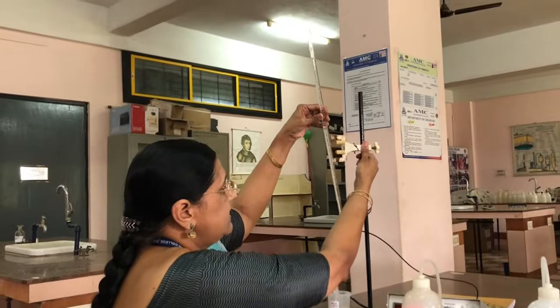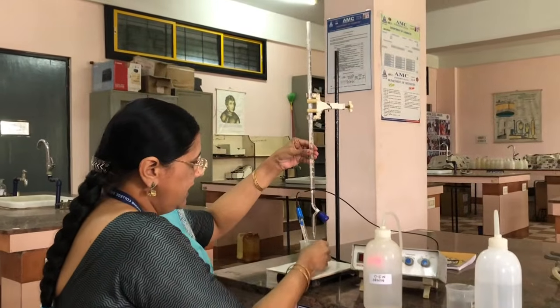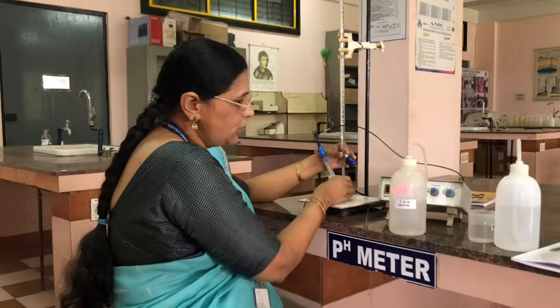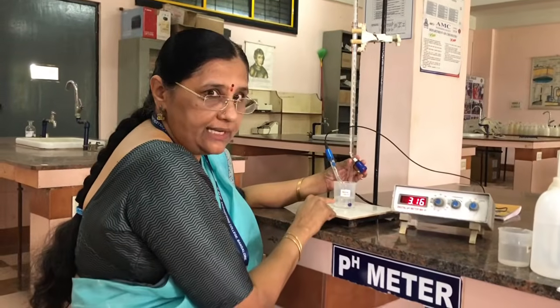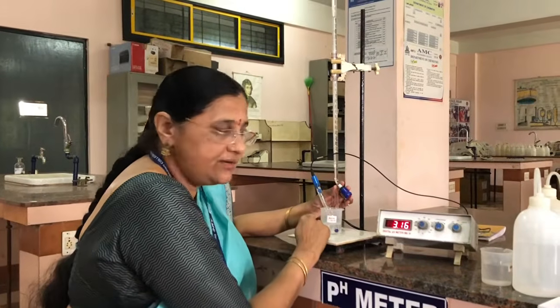And after filling this burette with the sodium hydroxide, you have to keep it on the stand in such a way that the nozzle of the burette should be inside the beaker. This is called the setting of the apparatus. Now we have taken sodium hydroxide in the burette. In the beaker we have taken acetic acid. The reaction between acid and base is one type of neutralization reaction.